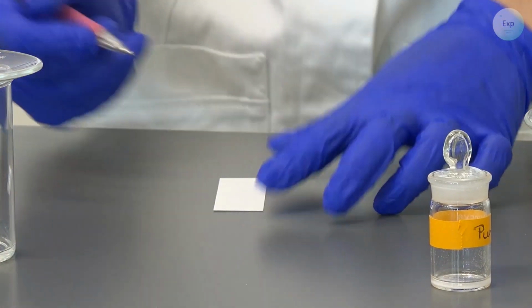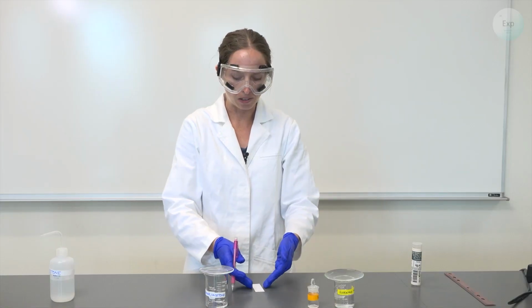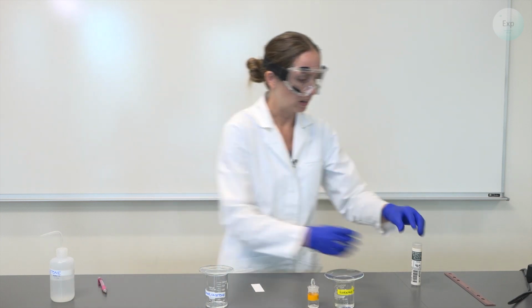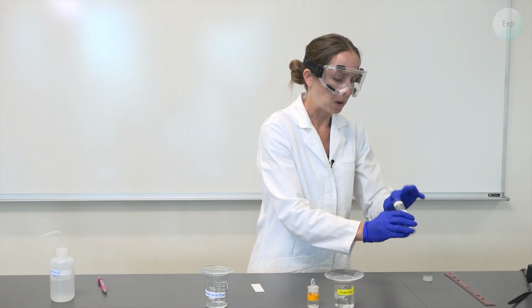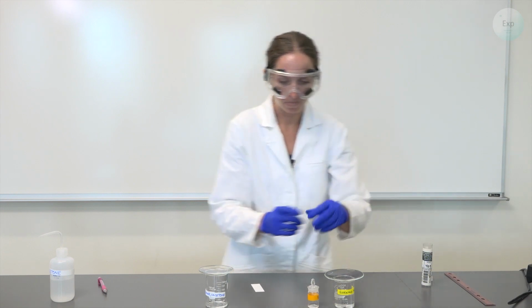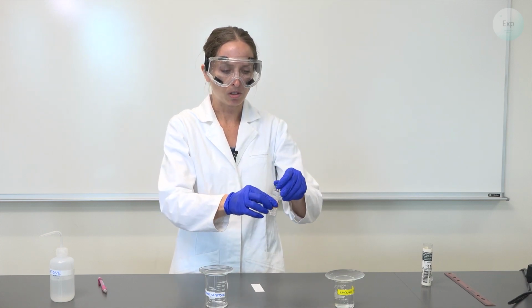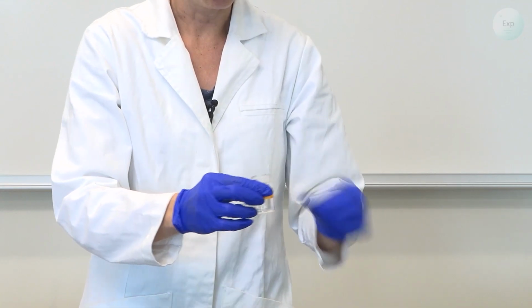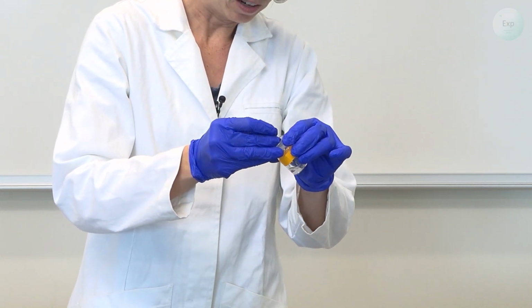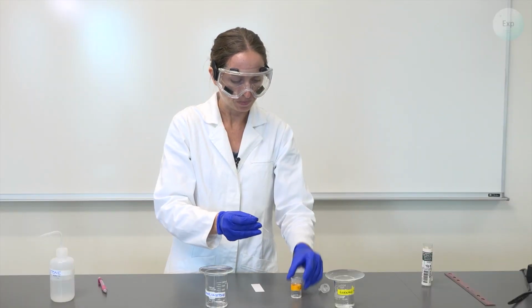One thing you want to be sure of is try not to directly touch the surface of the TLC plate in any way. If you have to handle it, try to touch at the edges of the TLC plate. Next, I'm going to take a clean capillary tube and spot it into the caffeine. So not all of the caffeine has dissolved into the acetone, but there should be enough of it dissolved in order to still see a spot by TLC analysis. I'm going to angle and try to take none of the solids, but just take a bit of the liquid at the top.